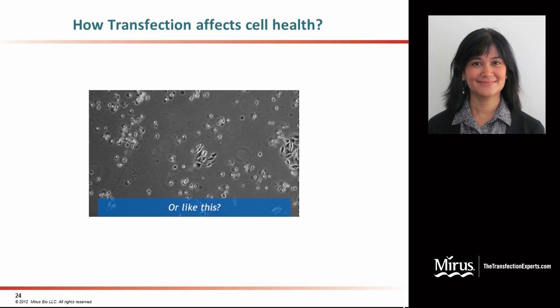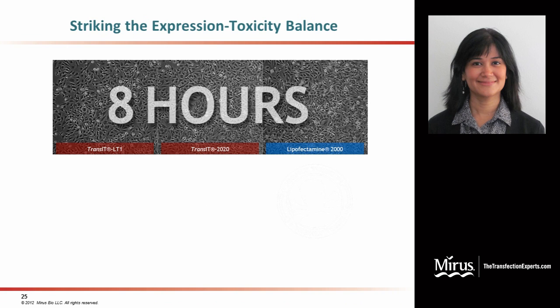These are HeLa cells that have been cultured and transfected using several different transfection reagents. A lot of different labs use HeLa cells as their cellular model. Unfortunately, oftentimes, depending on the transfection reagent that you used, your cells will end up looking like this. Now let's look closely at these HeLa cells, depending on what transfection reagent you use to transfect them. Here are a few examples.